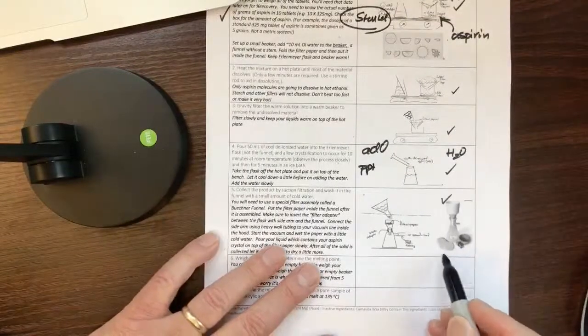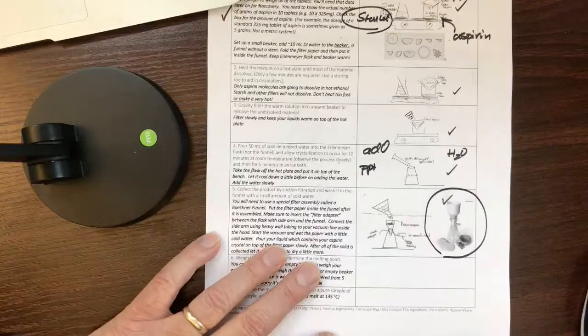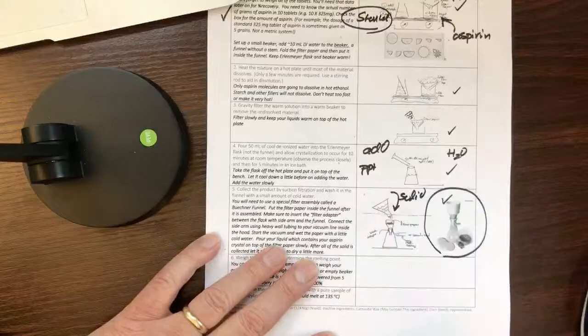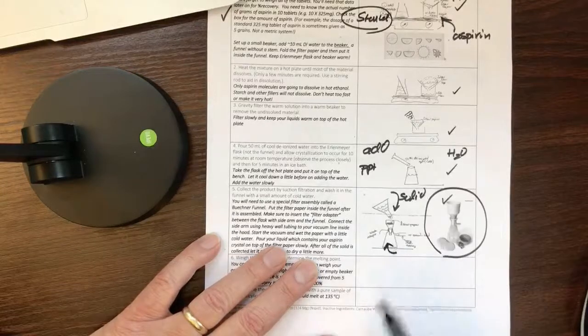What we're going to use, maybe you're not familiar with this, is a Buchner funnel. We put the solid in, and the Buchner funnel filters the aspirin for us. The liquid, basically ethanol and water, goes here.